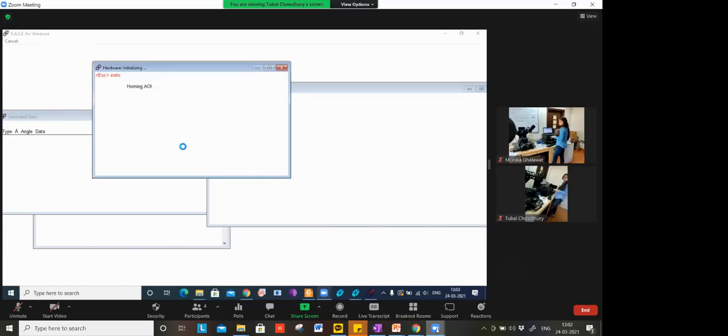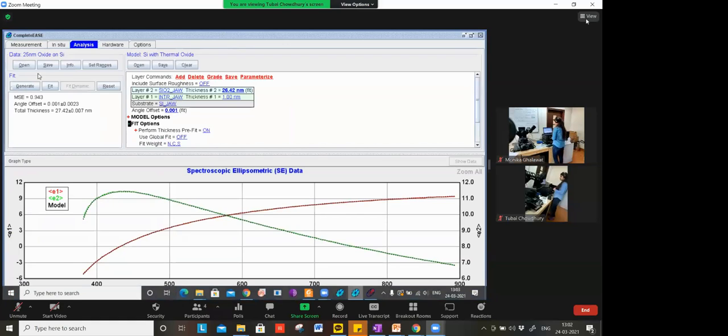Yeah. Hi. Is it fine for you if I show you in this software? You have already shown me what you want here. Okay, so you can just assign any model. Go to model, and you can reset it and go for it.